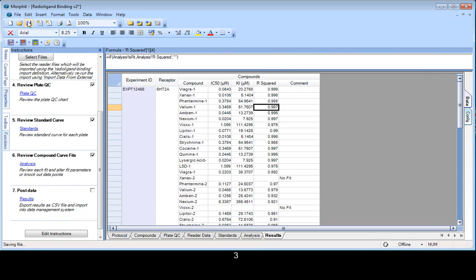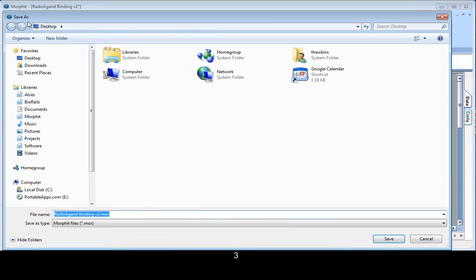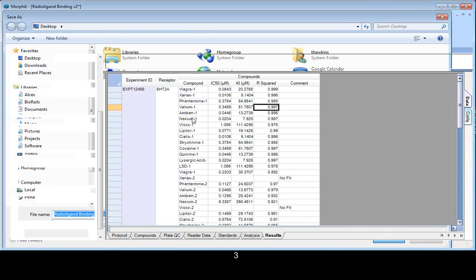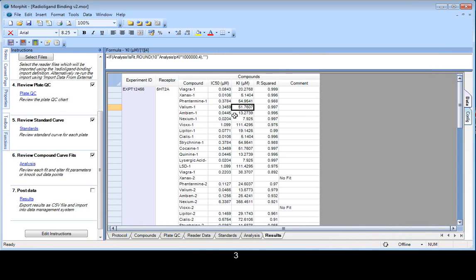And finally, save the binder. So that's the end of the demonstration. Thank you very much for listening. And please feel free to register and download this example and try it out for yourselves.